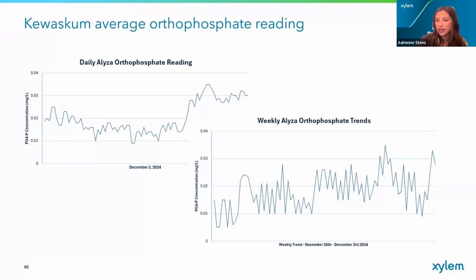The control scheme is based off of influent plant flow, so ferric pumps are always running, and then ferric pumps speed up and provide more dosing if PO4 levels rise above 0.2 milligrams per liter in the effluent, which hasn't been the case, but it's still keeping PO4 well under control. In fact, they're likely overdosing chemicals based on setting the pumps on influent plant flow instead of solely on the orthophosphate concentration.